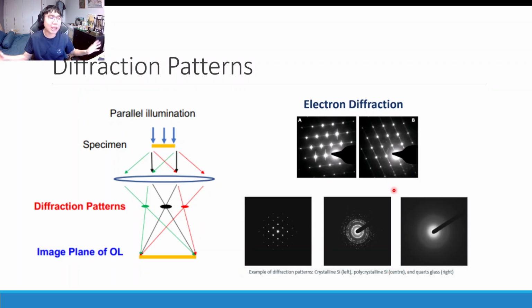And if you have an amorphous material, for example quartz, silicon dioxide, that is a completely amorphous material. There is no regular lattice spacing that can act as a regular diffraction grating. However, there will still be some form of diffraction, but in this case it will be more broader diffraction peaks. You will not see very clearly defined rings as in the polycrystalline case, but you just see very, how to put it, diffuse rings of light, so to speak.